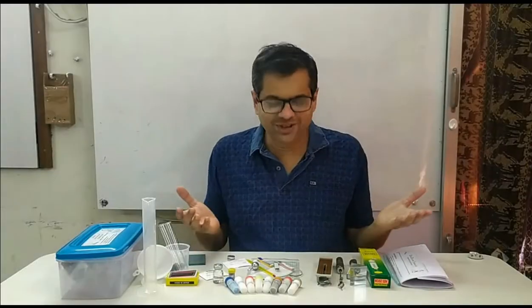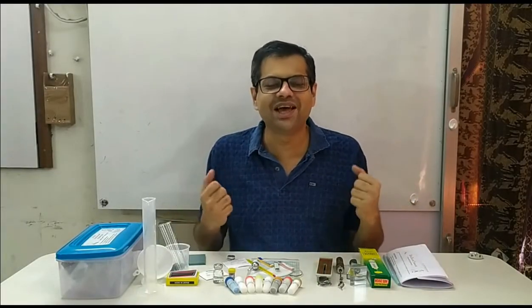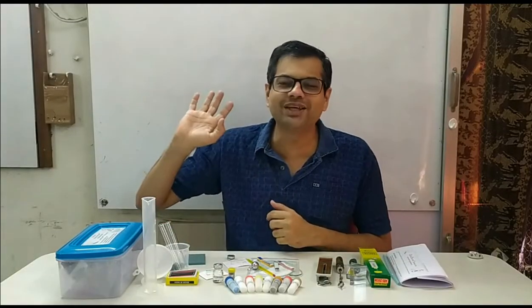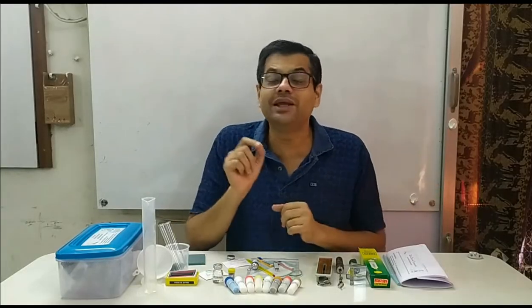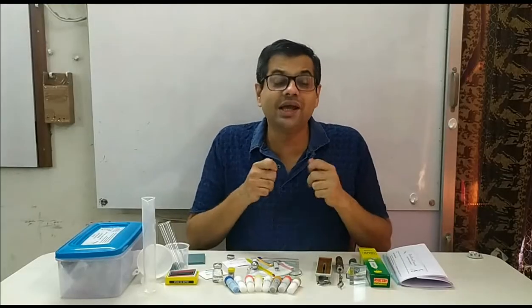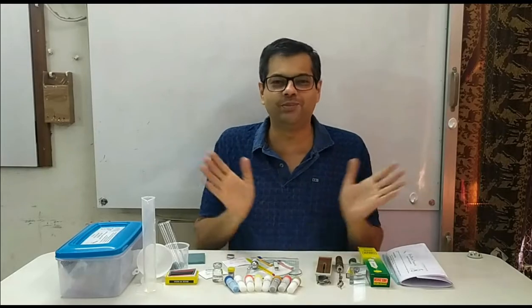Now all this material will definitely make you happy — what nice material and experiments I have got! But if you keep it nicely in the box and all the time keep the box in the showcase, that will not help you. It will make you happy, but it will not make any improvement. So you should start doing things, take efforts, struggle with the help of the material, and do the experiments. Then only learning will happen.